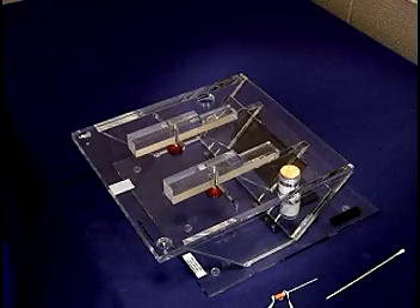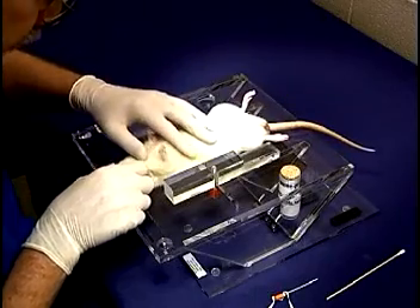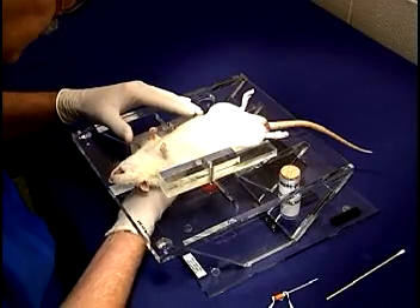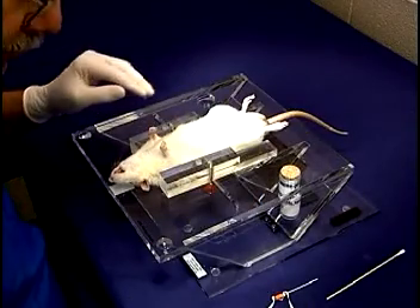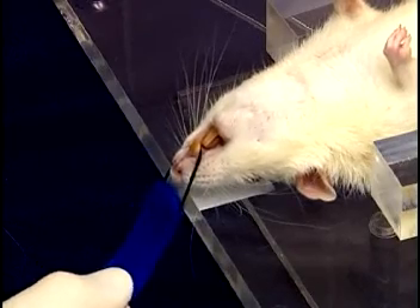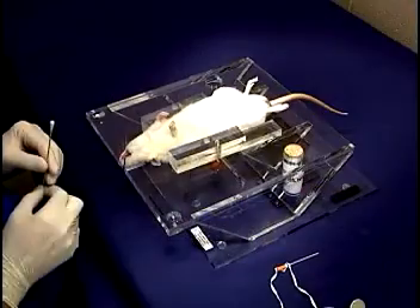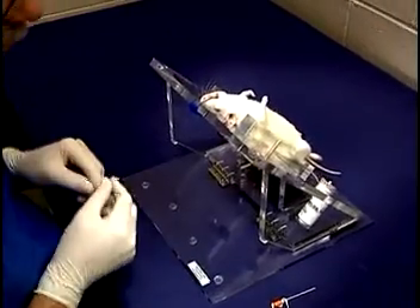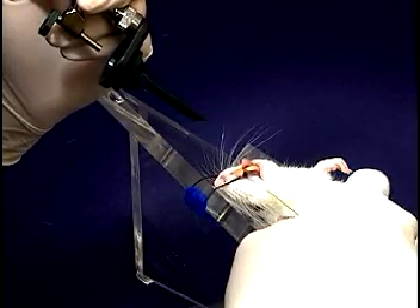Now we are ready to intubate the rat. The animal is placed supine on the stand as shown. The body positioner bars are adjusted to stabilize the rat and prevent it from rolling from side to side. The incisor loop is placed over the upper incisors and secured under the stand. The stand is tilted to 45 degrees, where the magnetic strips will hold it in place. A cotton swab is placed under the tongue and rolled towards the operator, withdrawing the tongue from the mouth.